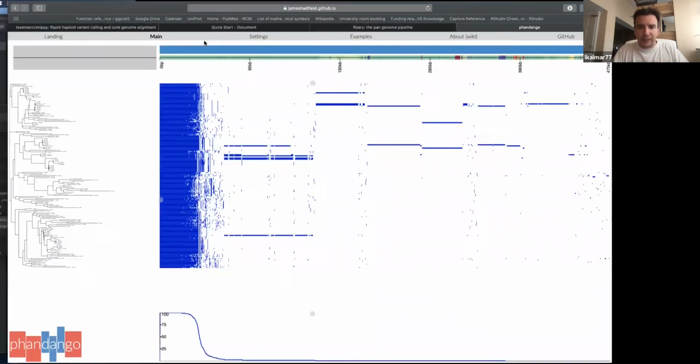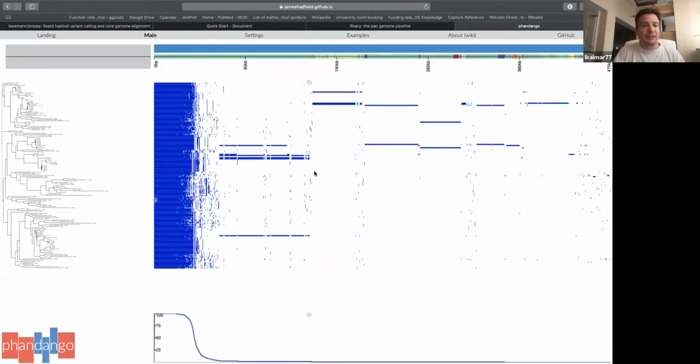Right. So something like this. I hope you can see something from my screen because it's quite small for me as well, but this is the tree here. And what you see here is the same species, but different isolates. And as we found out later, these are actually many different sequence types.